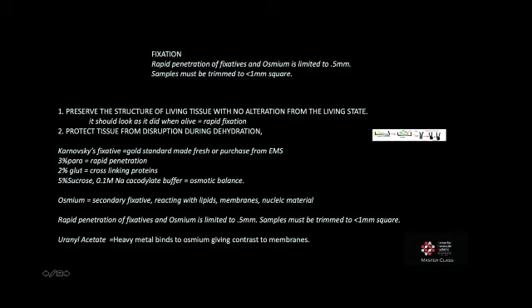The fixative that we're using is called Karnovsky's fixative. It is the gold standard, and it is especially the gold standard when it is made fresh from granulated EM-grade paraformaldehyde. If this is not available to you, you can buy Karnovsky's fixative from Electron Microscopy Sciences.